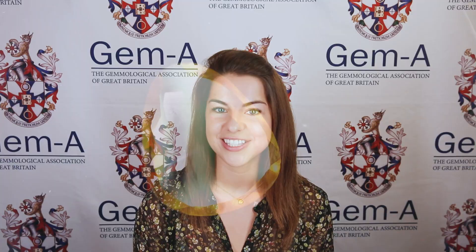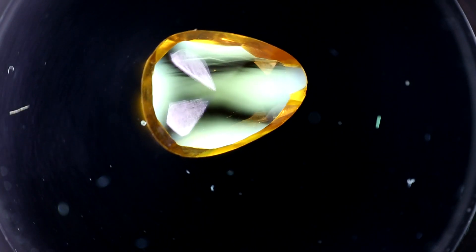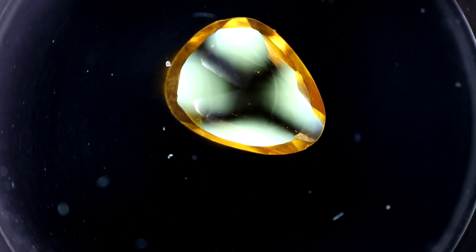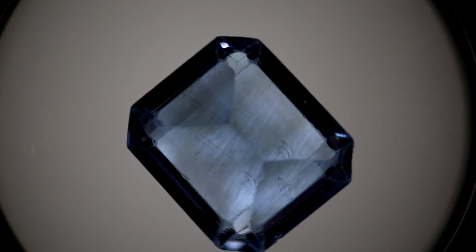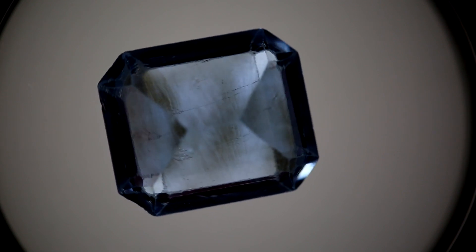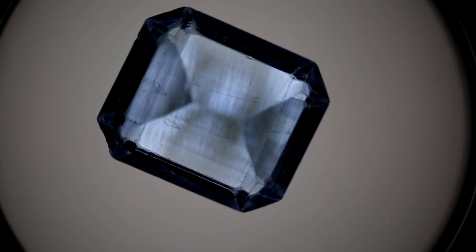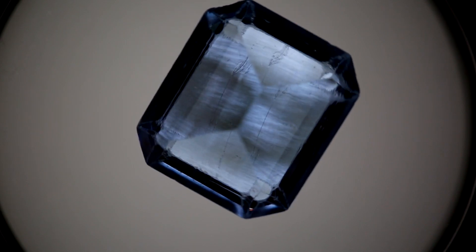Two of these ADR patterns can fully identify the gemstone. The first is writhing snakes, which is seen in most man-made glass, also known as paste. The second is tabby extinction, which is seen in most synthetic spinel. It is important to note that the shape and colour of the gem may affect the ADR pattern seen, so it might be harder to observe in darker colours.